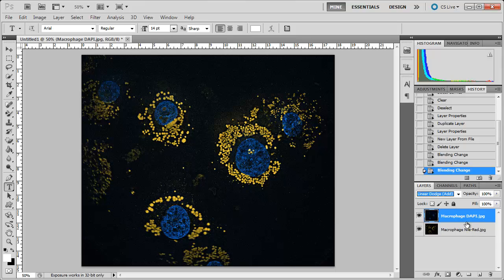Okay, and so we can keep these as two layers, or we can do a trick: if I select all layers and then press Ctrl, Alt, Shift, and E, it will create a new layer with the optical result. It's like a copy of what you see. It creates a layer with a copy of what you are seeing now.